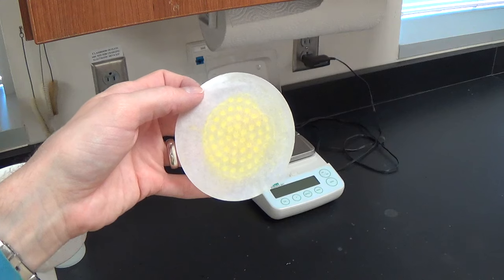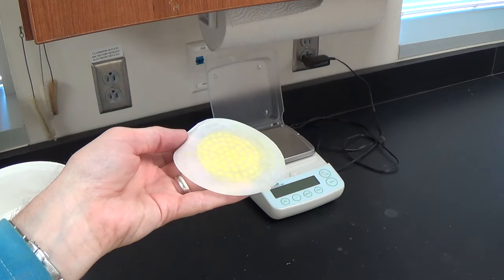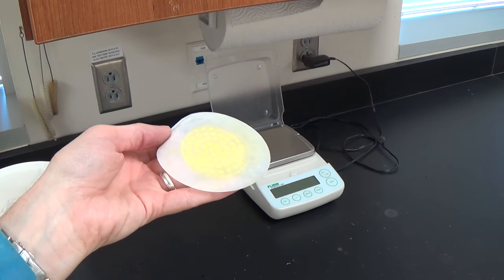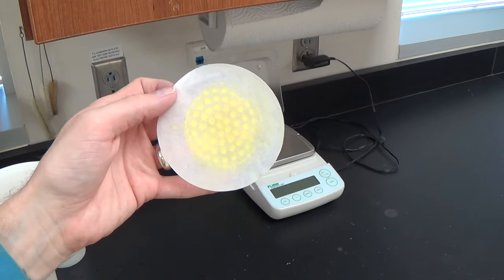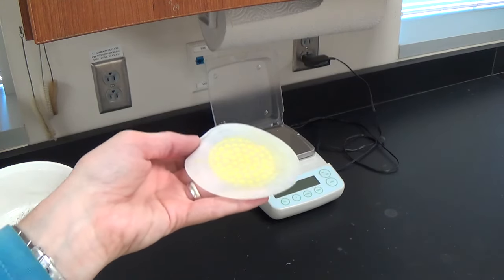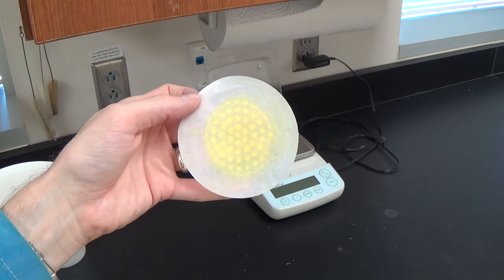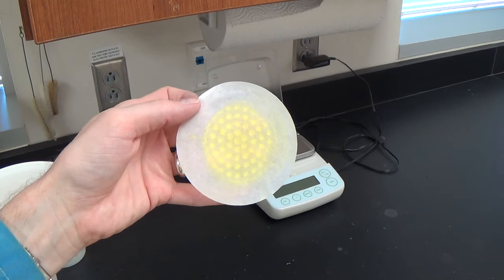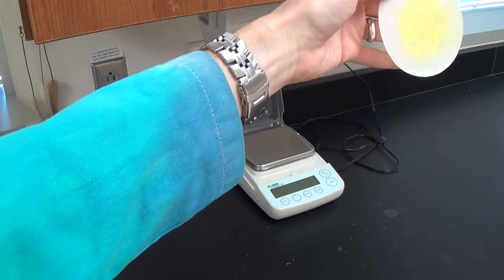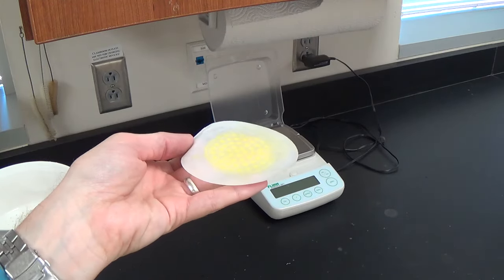If we had all the equipment we could ever ask for, we would have drying ovens. You could slide this in a drying oven, and a few minutes later all the water has been heated and evaporated, and we're good to go. We don't have drying ovens. What about over a Bunsen burner flame? You don't want to chance that because you could just as easily burn through the paper as you could heat away the moisture. So the safest thing to do, we're going to take this and put it in the windowsill until tomorrow.